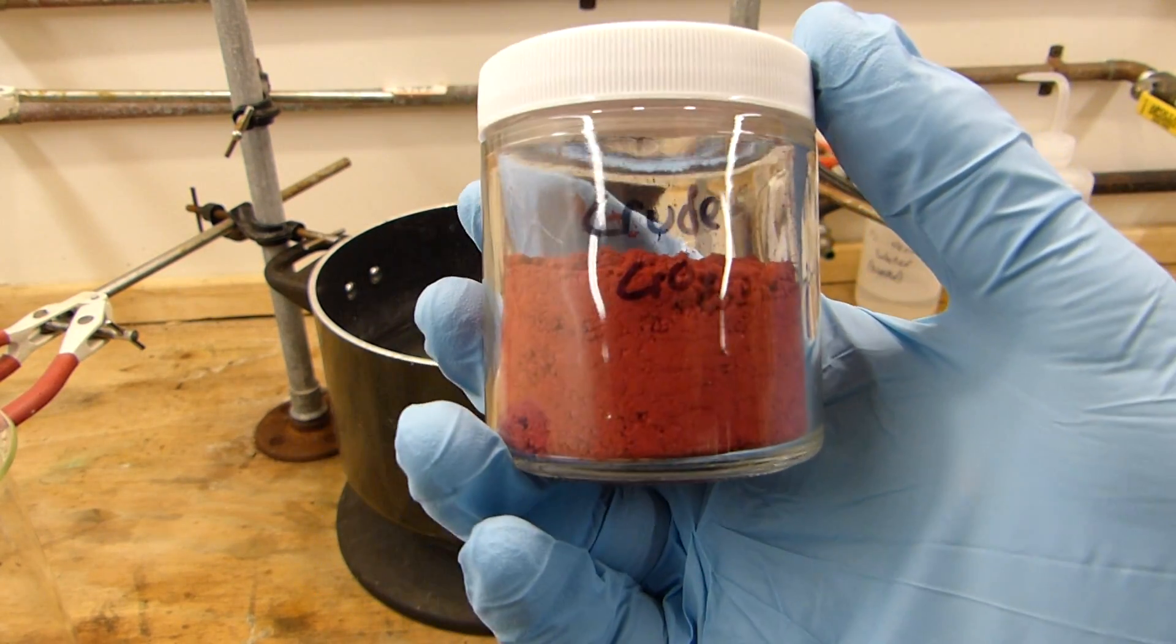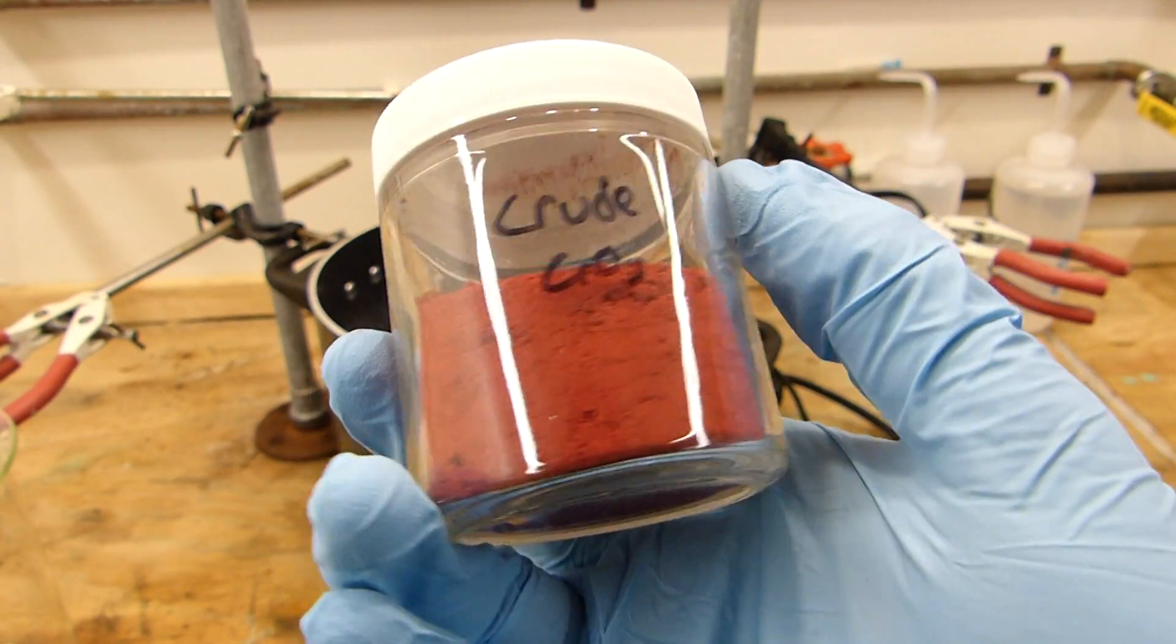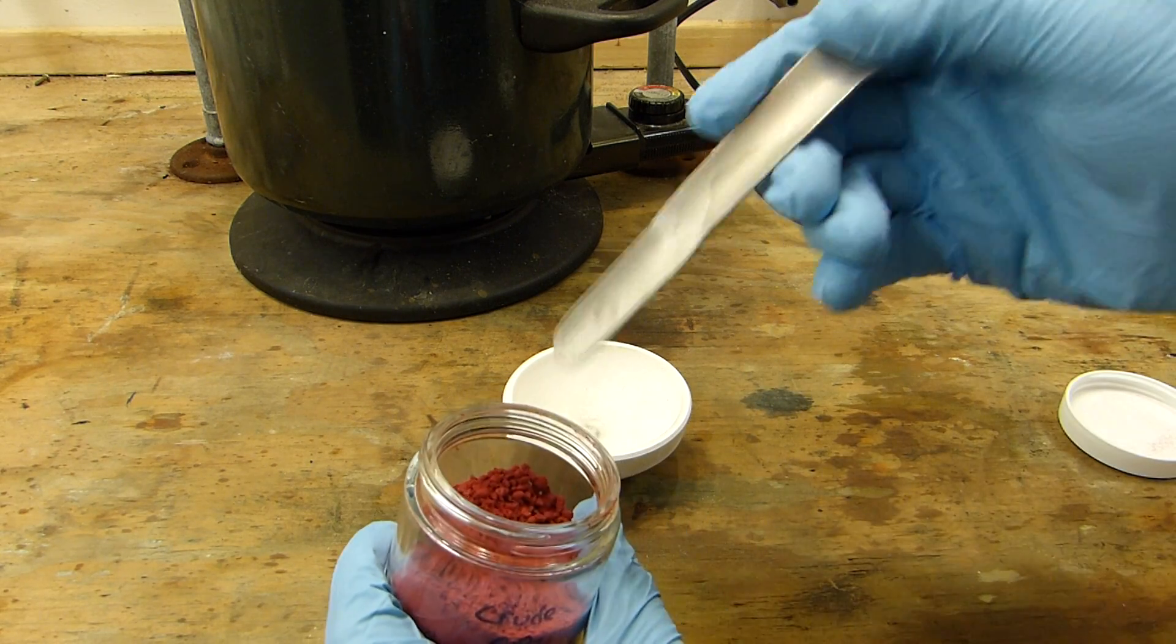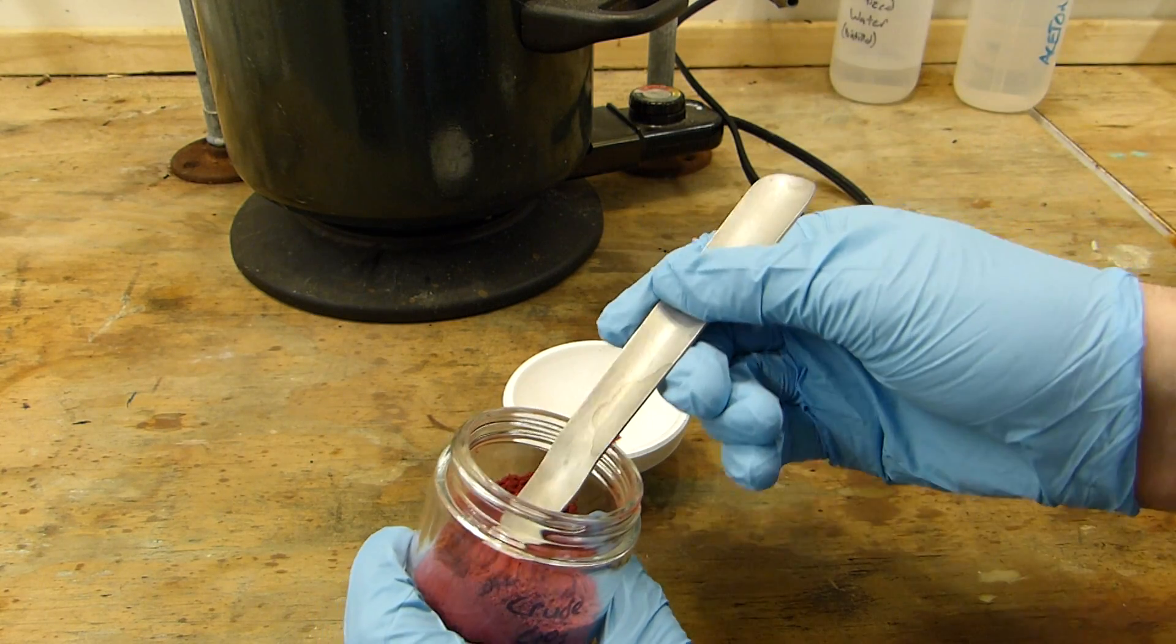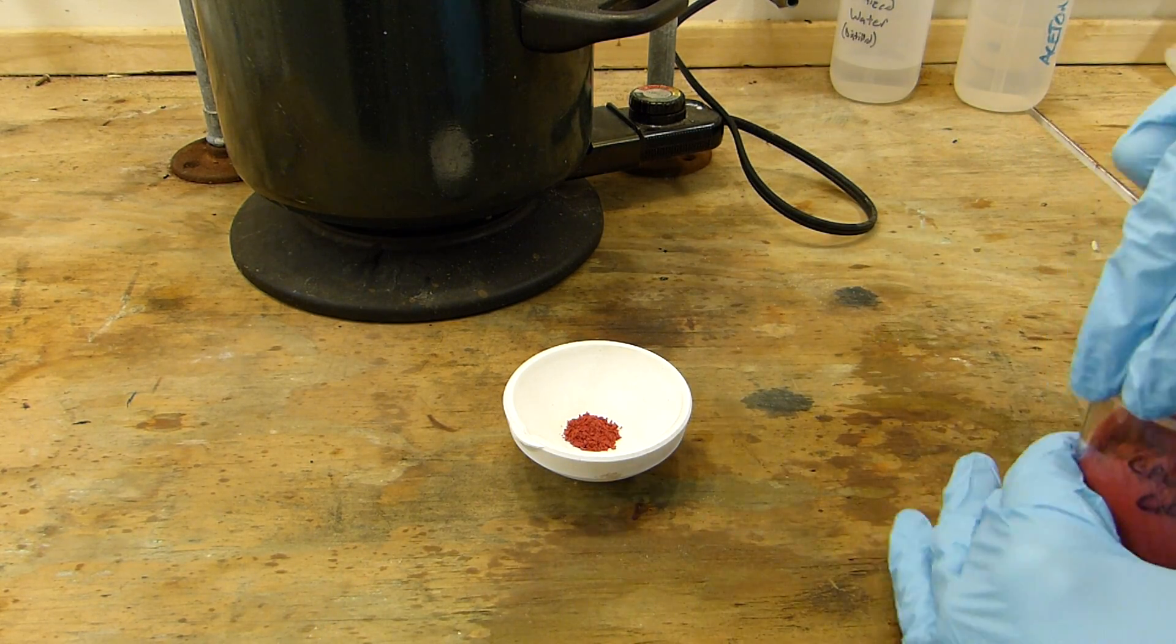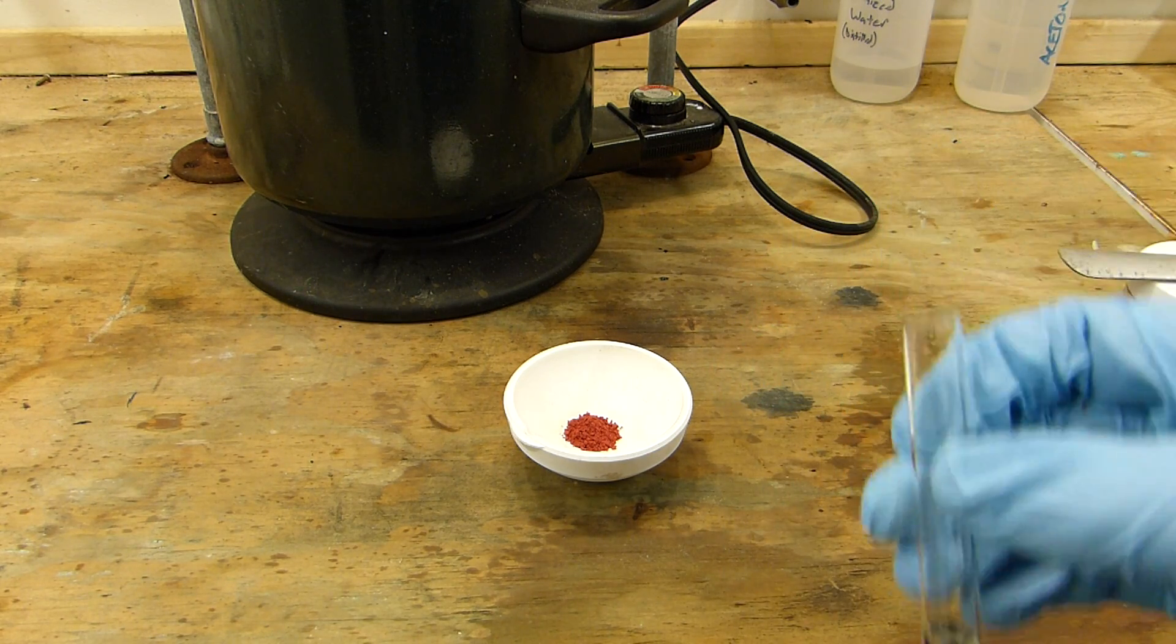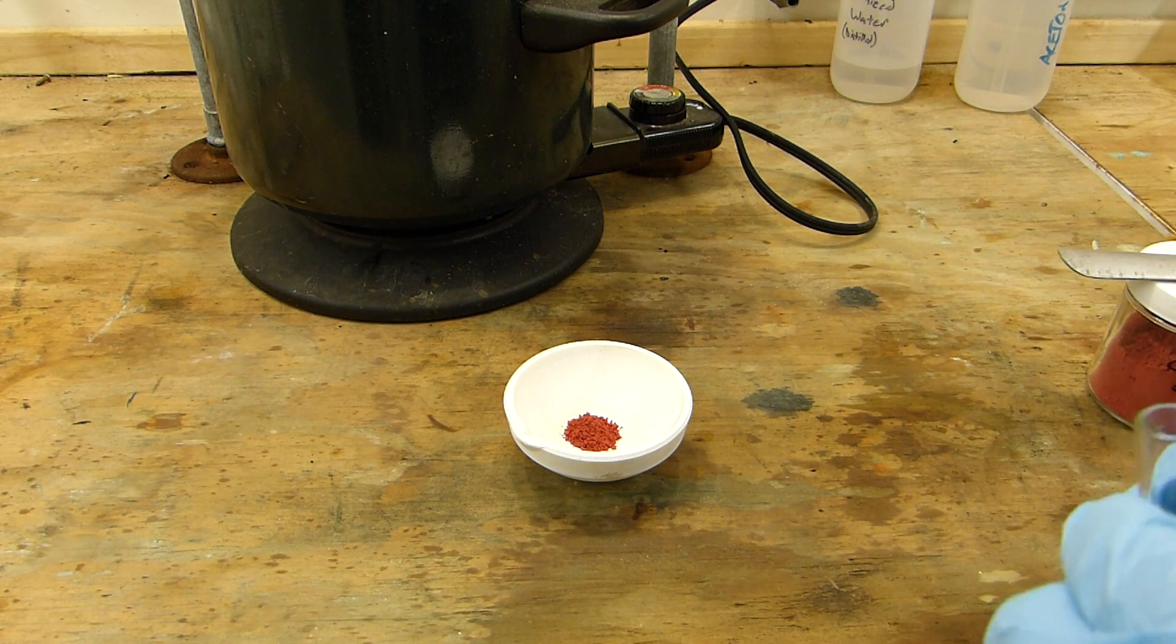I'll do a final demonstration to show the strong oxidizing properties of chromium trioxide. These strong oxidizing properties of chromium trioxide are easily demonstrated by simply placing some in the bottom of the crucible. Get a good amount there. And I have here a test tube with a small amount of methanol in it, and I'm going to pour the methanol onto the chromium trioxide and we'll see what happens.